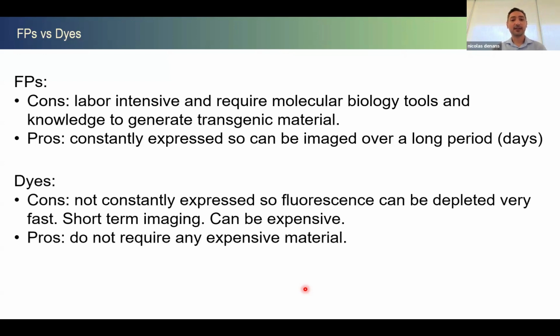For the dyes, the cons are that they are not constantly expressed, right? You put your dye in your solution, and that's it. So you have a finite pool of dye, and this can be depleted fairly fast. So it's more for short-term imaging, and some of these dyes can be quite expensive. The pro is that you do not require any expensive material or any knowledge in, for instance, molecular biology. You just put it in your solution with the right concentration and the right tricks. It's not that easy, but you don't need to have so much knowledge about it.